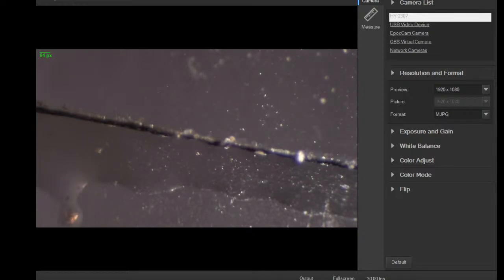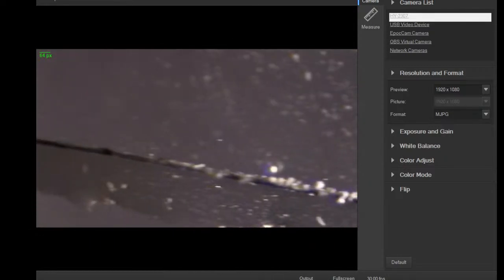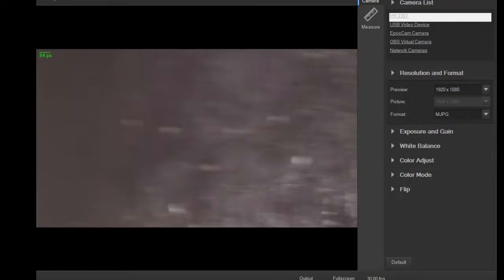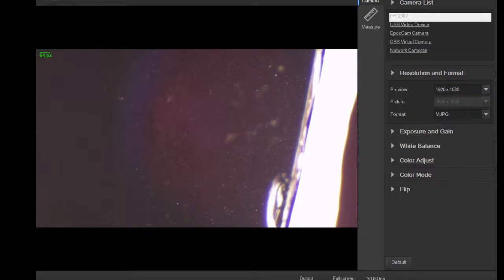Whoa. Just sped up there. That was weird. You can see when I tap, it kind of pulses a little bit. And you can see the cover slip is not super smooth. There's some little kind of rough edges on it. There's a cool kind of a light effect on the edge of the cover slip.